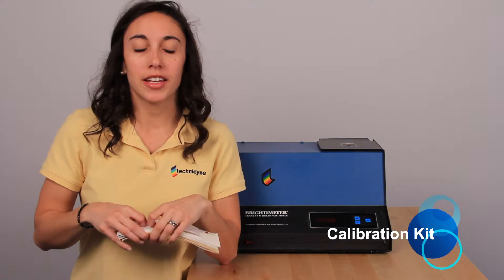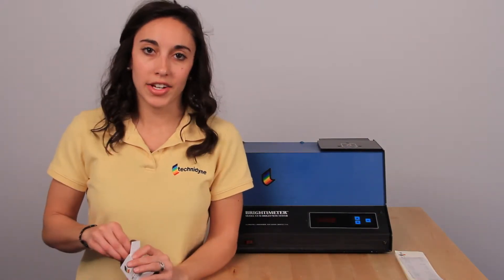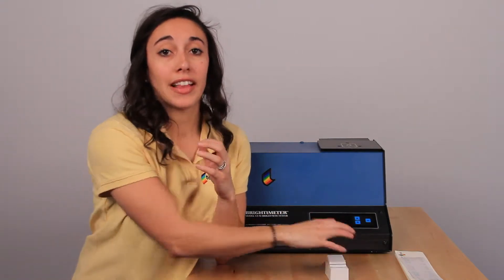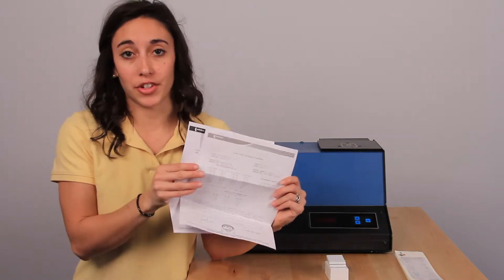There should be a 50, a 60, a 70, an 80, and a 90. The next thing that you should have are your opal standards. And the last thing you'll find in your calibration kit are your traceability and your verification forms.